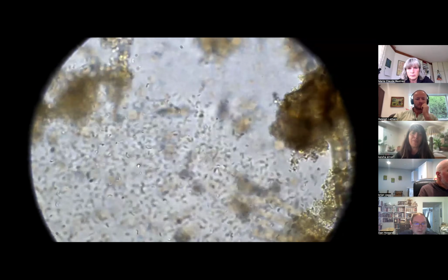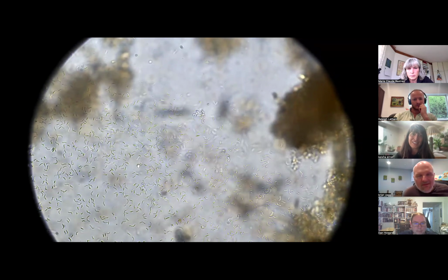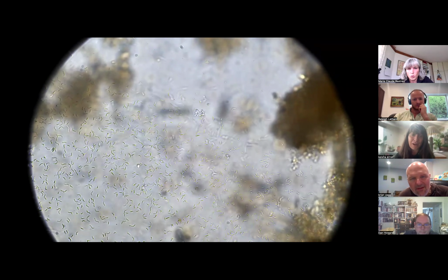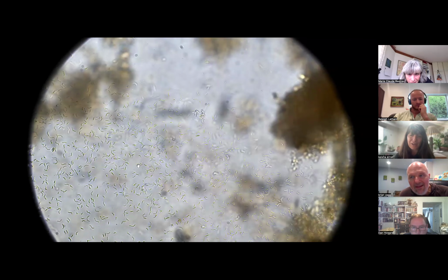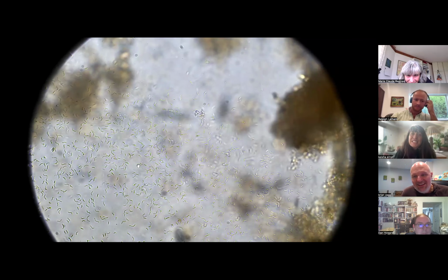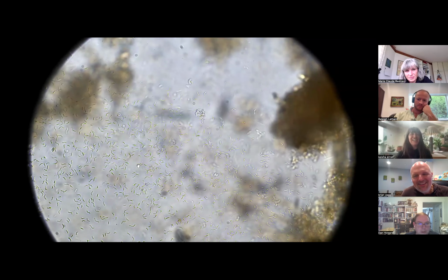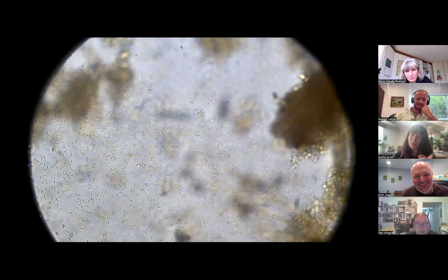Look at how many spirilla there are in one view. Wow. These can be misconceived as good guys, because people say, oh, I saw this good buzzing and zooming. And it's like, no, you saw a reason to wash your hands.